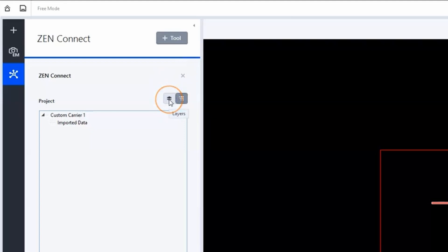And a layers tab which is helping you in visualizing your images in the correlative workspace. A project is automatically created as soon as you enter the free mode.